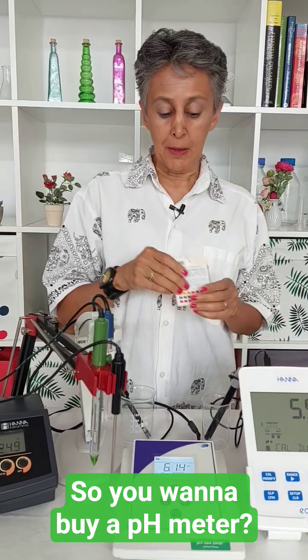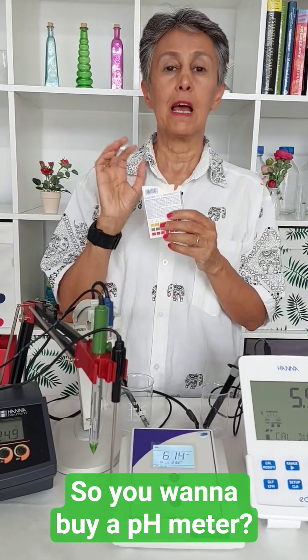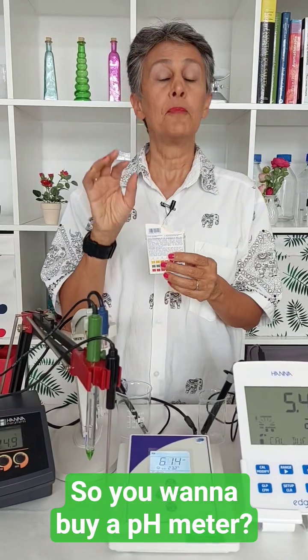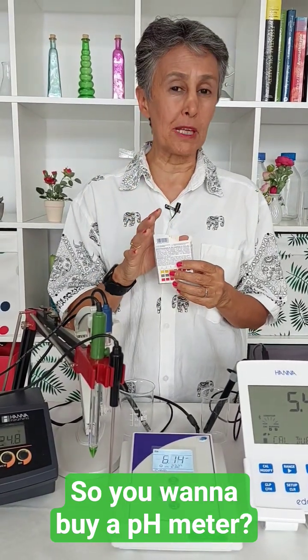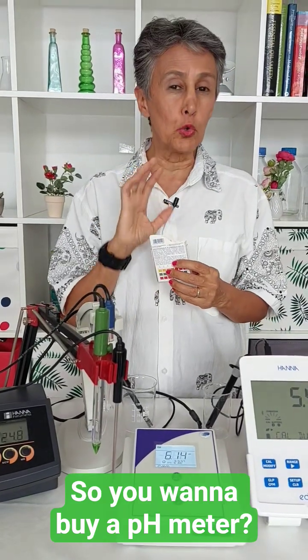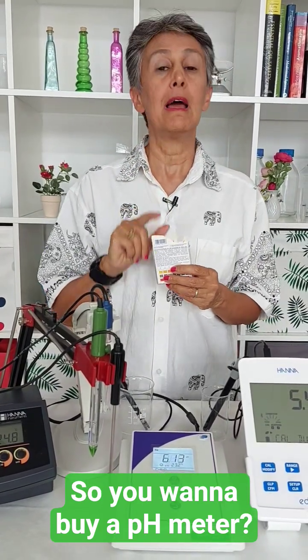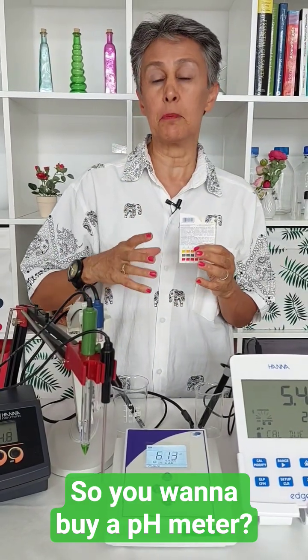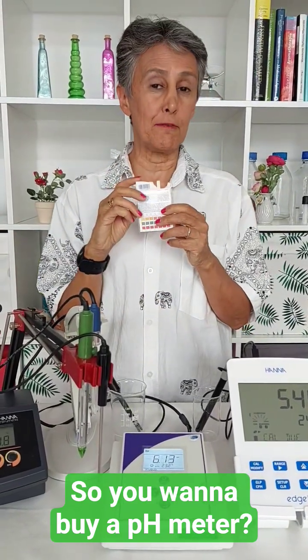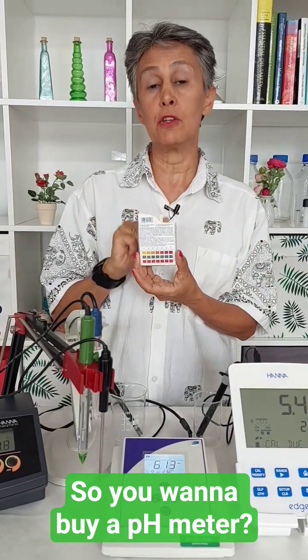The first option that most students, novice formulators, or DIYers start with are pH measurement papers or strips. They are available in different forms and at the beginning they are very affordable and very easy to work with — you just take a piece, measure your pH, and you are good to go. But in the long term, they are actually not affordable at all, and they are not precise. If you are measuring pH several times a day or several times per week, these strips are not cost-effective, and they are not precise.